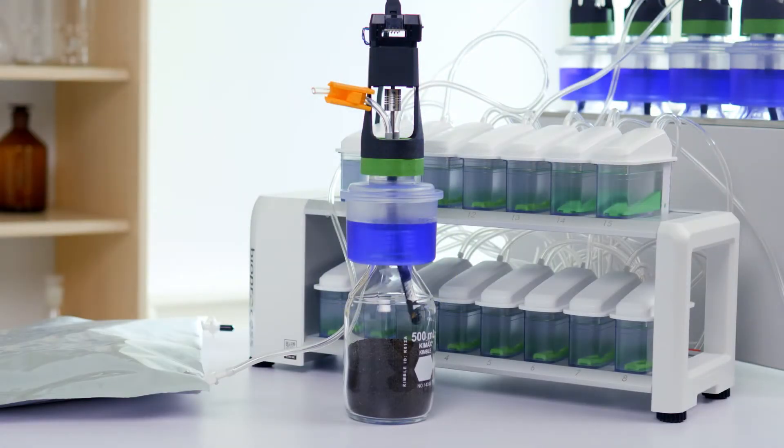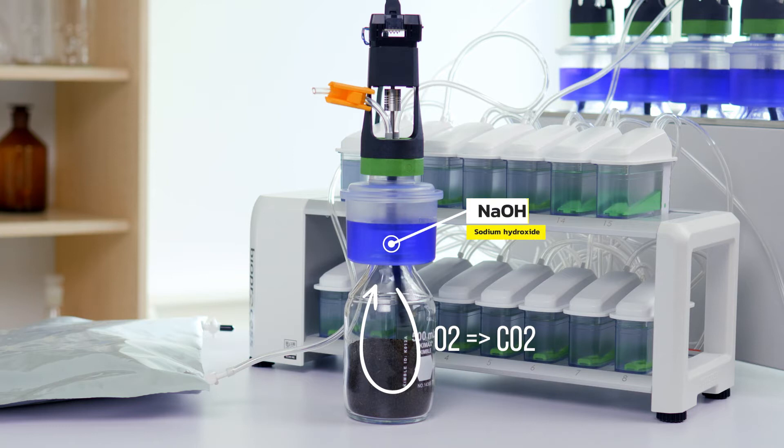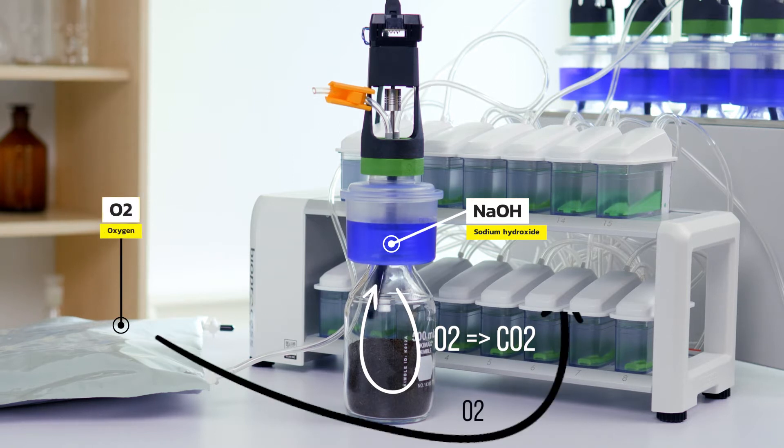Let's have a look at some graphics of how it works. Inside the bottle, oxygen and the studied sample is converted into carbon dioxide. The carbon dioxide is then absorbed by sodium hydroxide solution in the gas removal unit. The loss of gas leads to an under pressure that in turn sucks oxygen gas from an oxygen source.